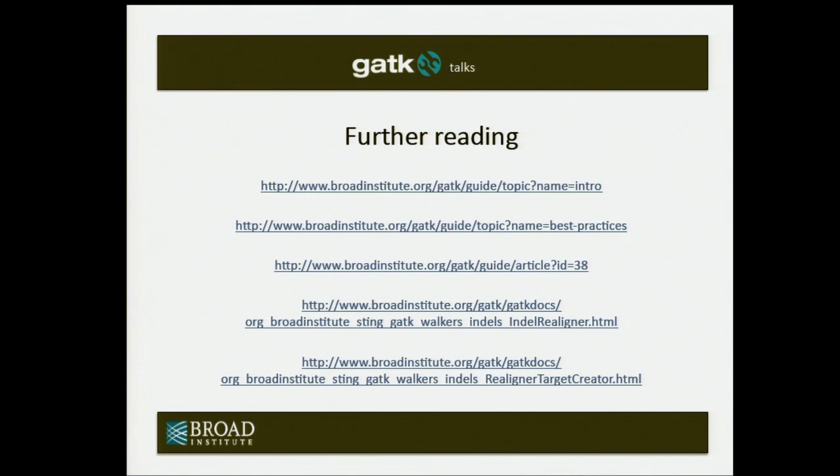Good question. If you're providing a set of known SNPs, what about novel SNPs, those not in that list? Right, you're really providing a set of known indels. All this realigner is concerned with is indels. There is a heavyweight Smith-Waterman mode, if you can't tolerate false positives. That will use known SNPs and find regions of dbSNP where there are a lot of clustered SNPs, because it thinks that can't really be, and it will test that hypothesis. But generally, it's the known indels that you're looking at.